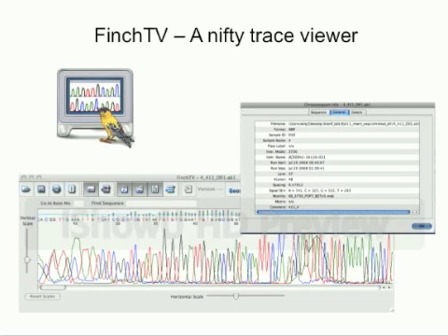So to configure the Phred program, you need to have this file name to put in its configuration file, so that Phred knows how to call the quality score for the sequence. So I use this program to find out what that file is. And it's also very easy to look at the quality of the sequence reads.